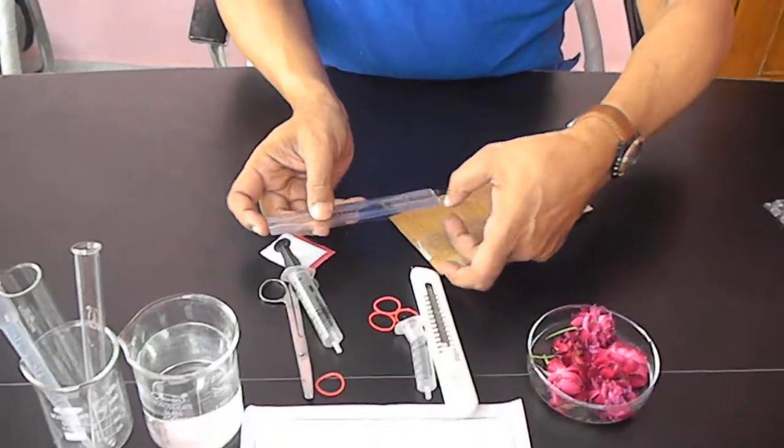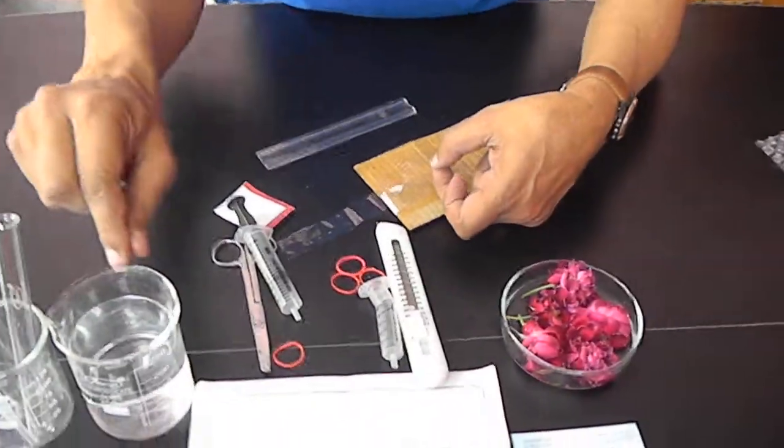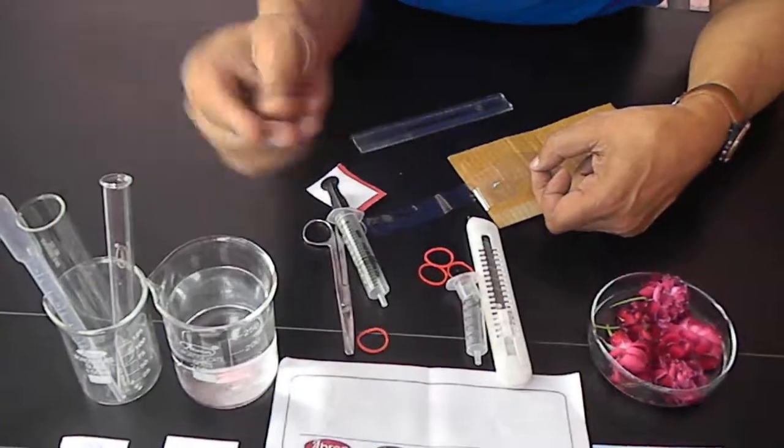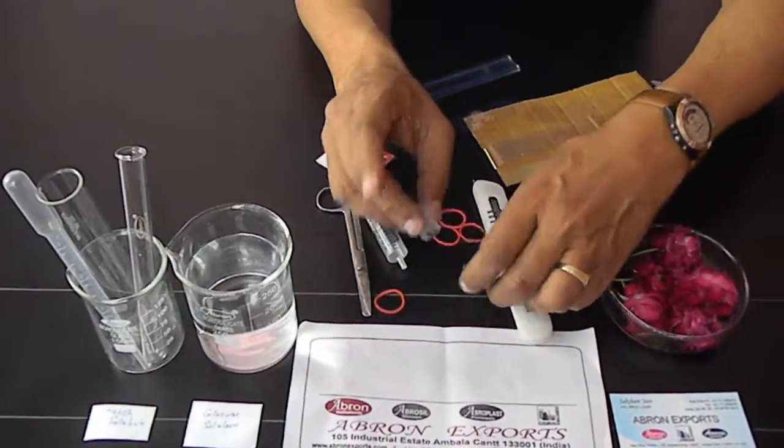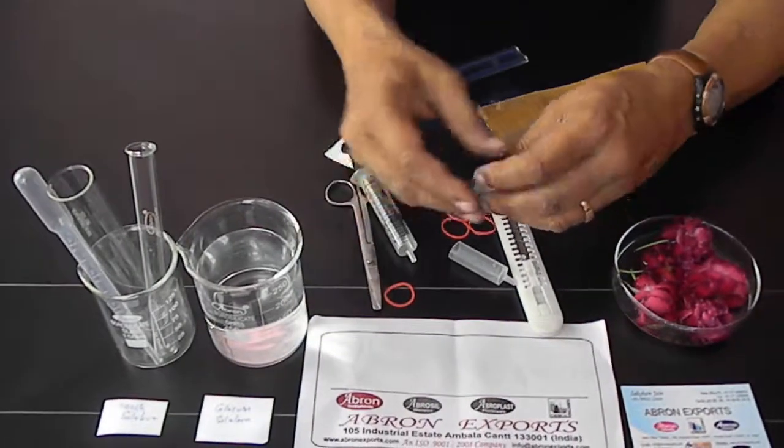Using the cutter, you cut it and then put it inside water, simple water, so that it becomes soft. In the meantime, you cut one syringe - only the top part - taking out the bottom part.